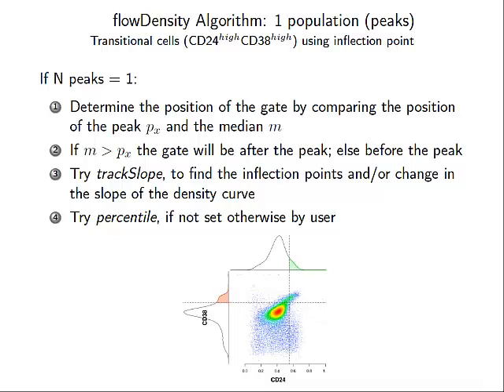This is where it takes two days for a gating hierarchy. For this example where there's one population, there are five different ways to do it. This is the hard problem, and this is why automated gating, in a general sense, does not work for diagnosis. You can't use flowMeans, SamSPECTRAL, FlowClust, SPADE, or a general unsupervised algorithm for diagnosis, because it's going to use the same approach for every single cell population. That doesn't work because the rare populations are what get you. For these rare populations, you have to try five different ways on your own data to get that threshold right.